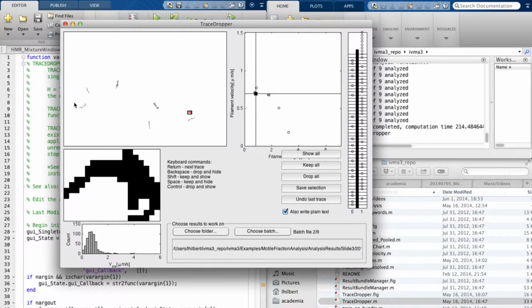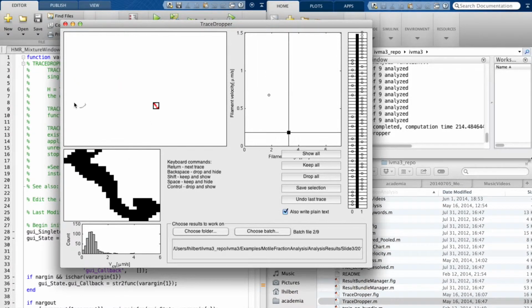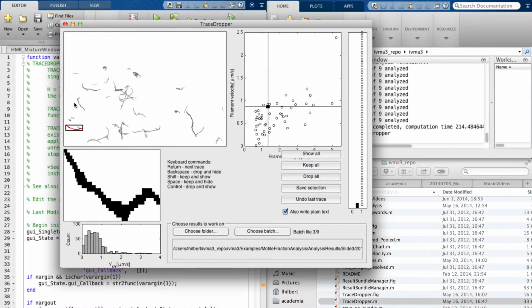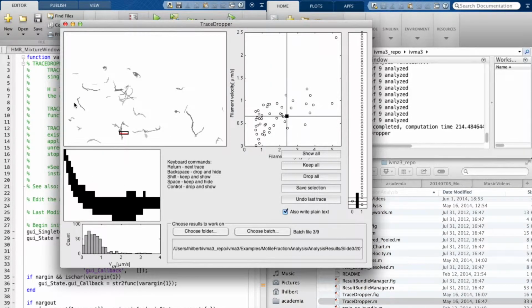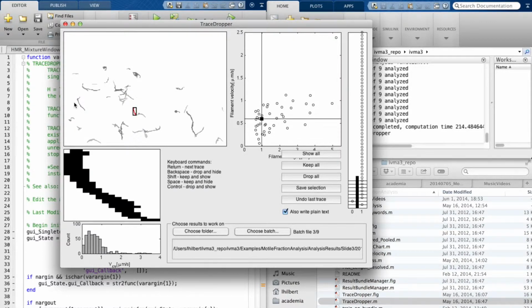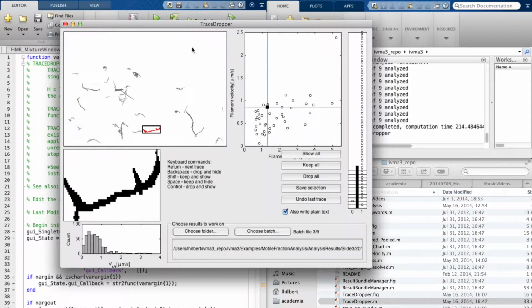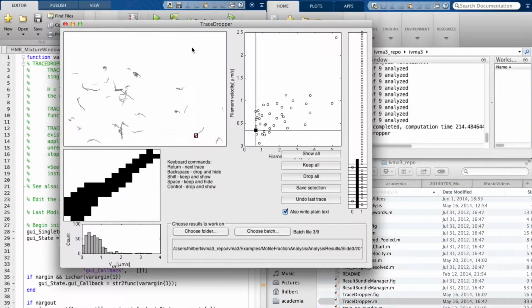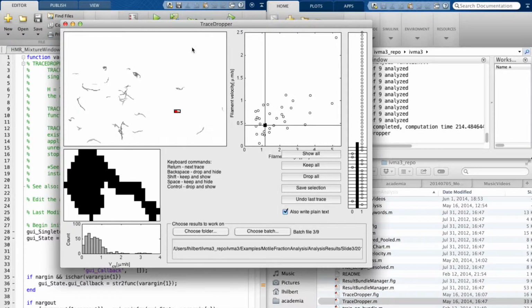And for some, they're just straight like here, so it's a pretty clear case. But everything in between, you just should be consistent in how you reject them and keep them. Other than that, there's a little bit of freedom in how to do this. You just have to find a standard for yourself or for your lab that you go with. And you can use my choices here that you can see tracked on the right as an orientation if you so wish, or you need some hints as to what to keep and what to reject.